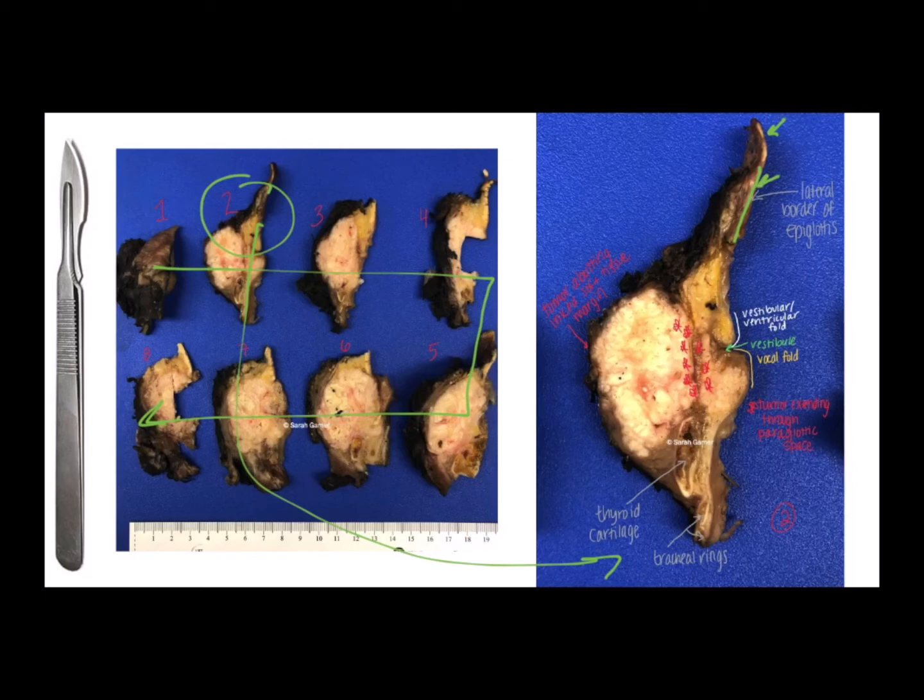So on either side of that, you're going to start that paraglottic space, right? If we were a little bit more medial, like maybe even on the other side of this, if we flipped the section over, that would be the pre-epiglottic space. But because we're now lateral to that epiglottis, this down here is going to be that paraglottic space. And remember, that's continuous with that pre-epiglottic space. So here you can actually see the tumor extending into that paraglottic space.